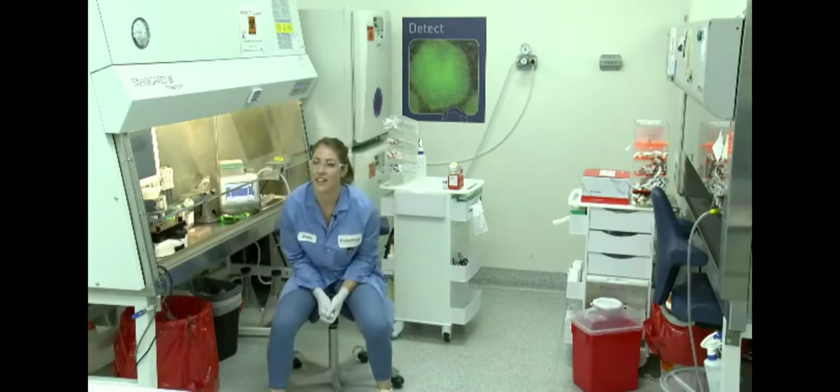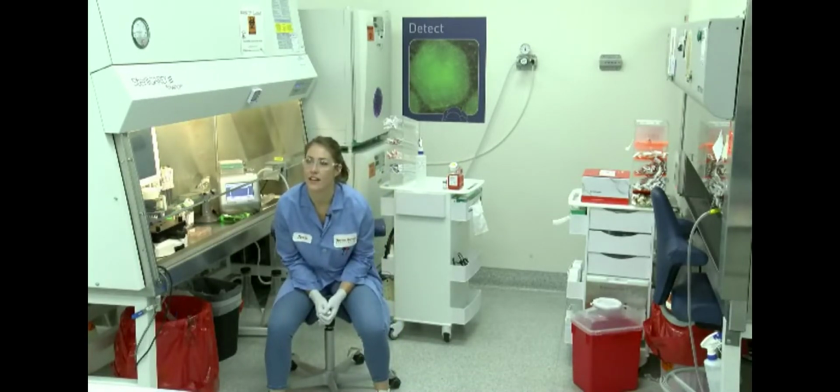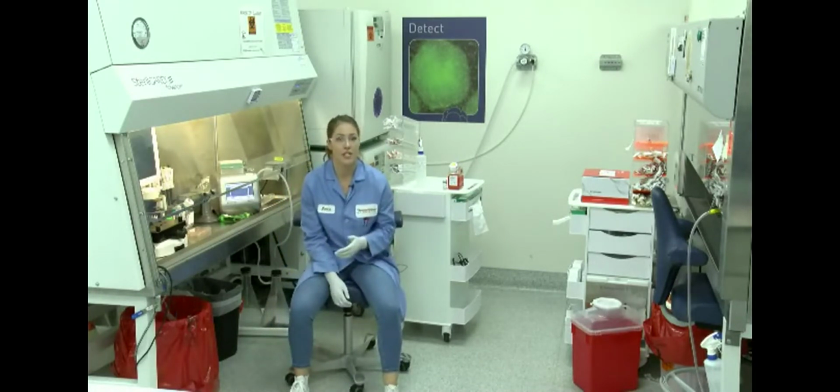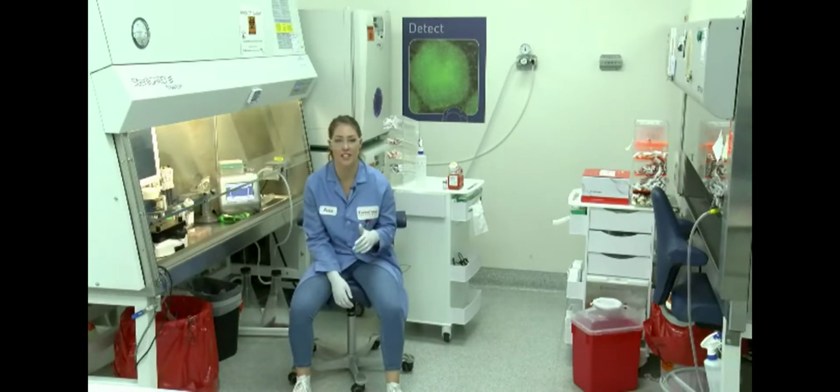Okay. Going back to the Neon device itself, is there any difference in the efficiency between the 10 microliter tip and the 100 microliter tip, and would there be a reason in terms of efficiency why you would choose one over the other? So I would definitely choose which tip to use based on what the recommended protocol says. But there's no reason to believe that there's a difference in transfection efficiency between the 10 microliter tip and the 100 microliter tip. Something to keep in mind though is that you do need to scale up your transfection, so make sure that your cell density stays the same. Also, if you do see that it doesn't work as well when switching between the two tips, you can adjust the voltage slightly, and that should correct for any differences that you see.